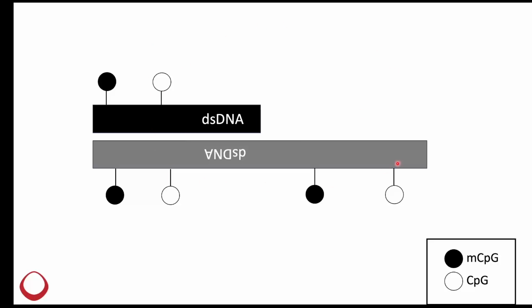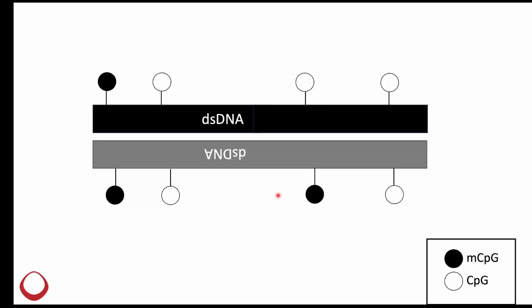So here you see a DNA fragment with a recessed 3' end or a 5' overhang. And then you have the methylation status of this molecule in these filled in lollipops or empty lollipops on top of the DNA. So if a methylated cytosine happens to fall on a recessed 3' end, repair will fill in that position with a newly synthesized cytosine. But it's not methylation aware. So the cytosine it just fills in is unmethylated. And biologically speaking, that shouldn't happen.